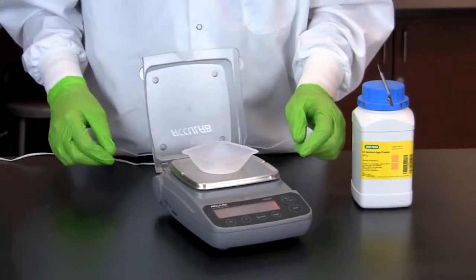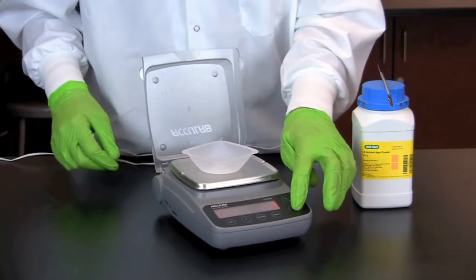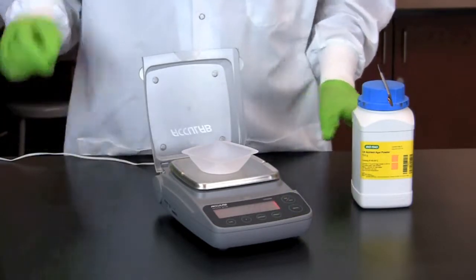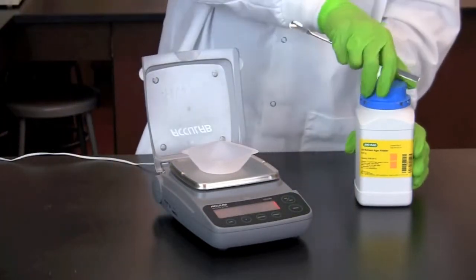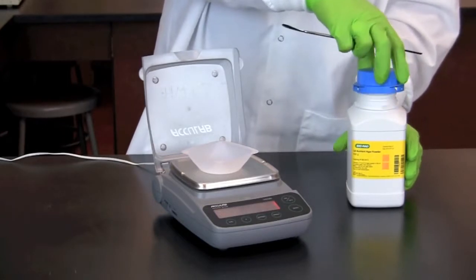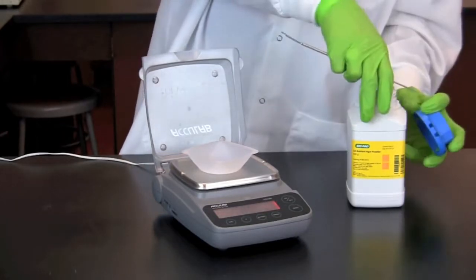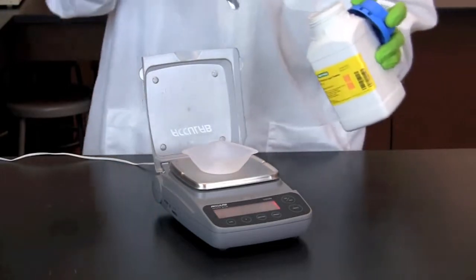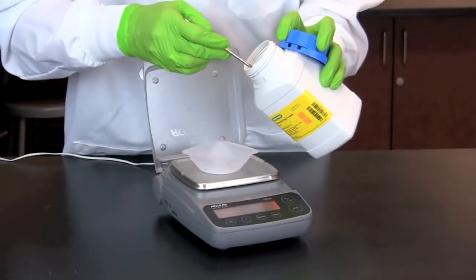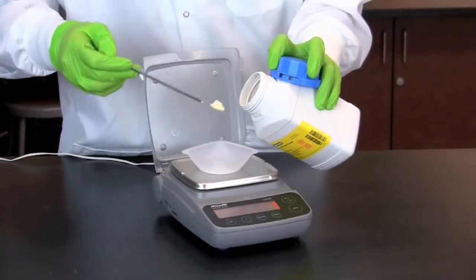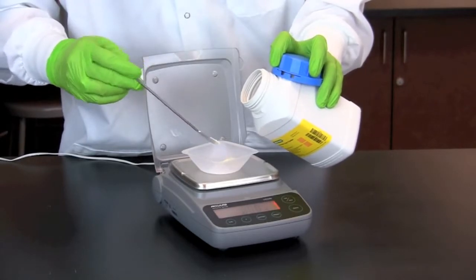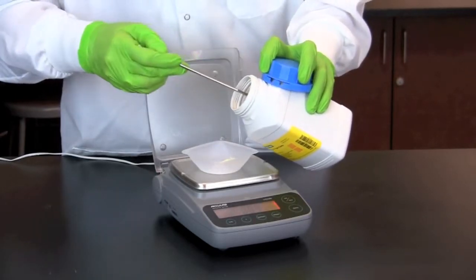Using an electronic balance, we place a weigh boat on the weighing platform and zero the balance. We then add LB agar powder slowly using a clean spatula until the proper amount is reached.